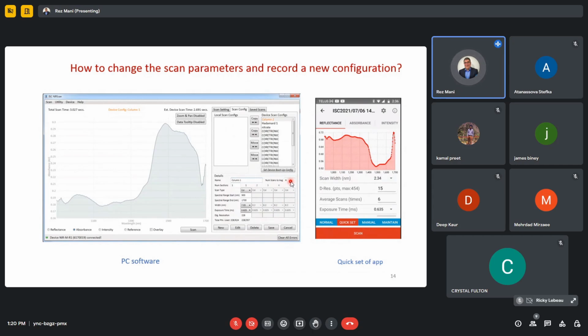Of course, 6 would take shorter time than 100. 100 would typically take about 220 seconds to scan. 6 would be only 3 seconds. But there's no problem changing number of averages. But for other parameters, you need to record a new reference.